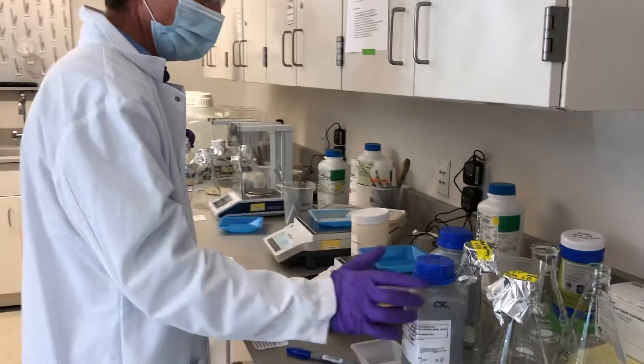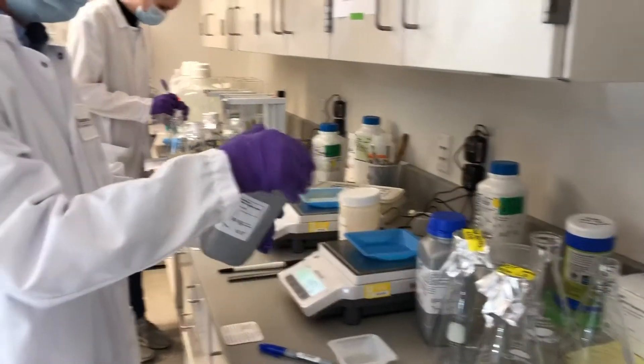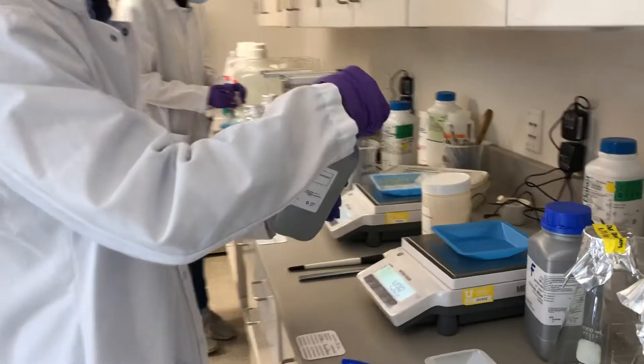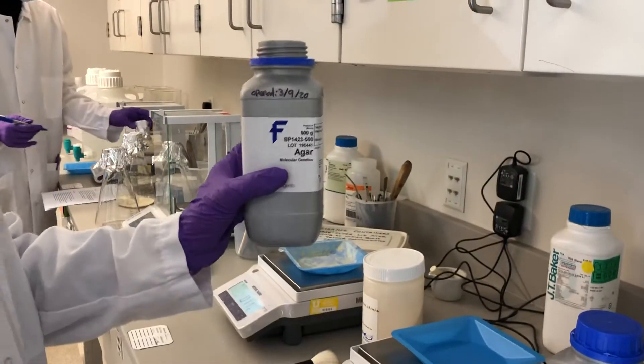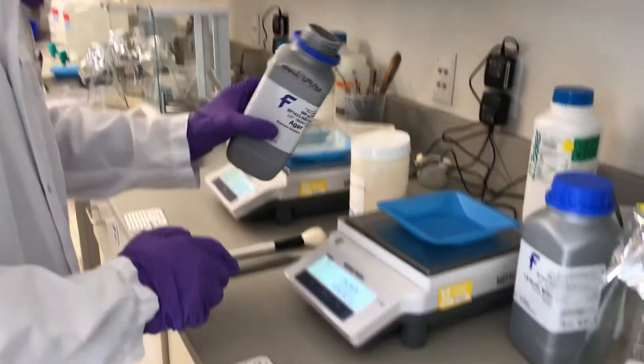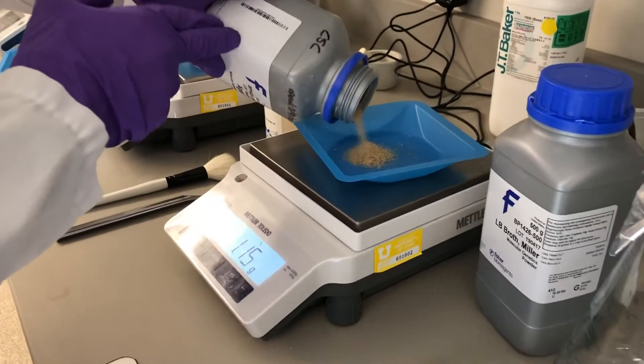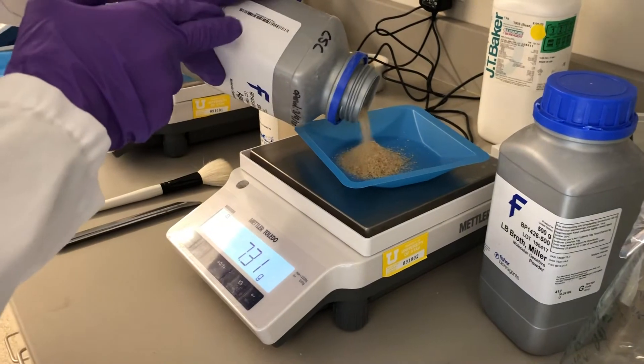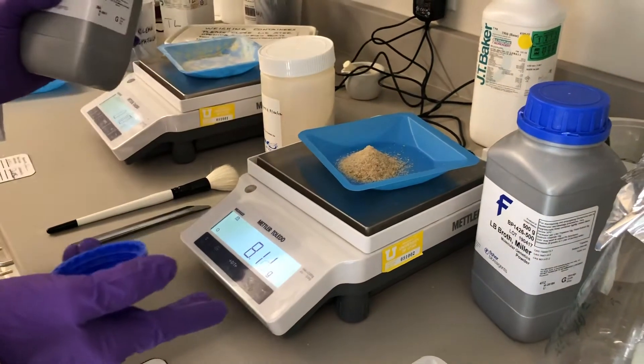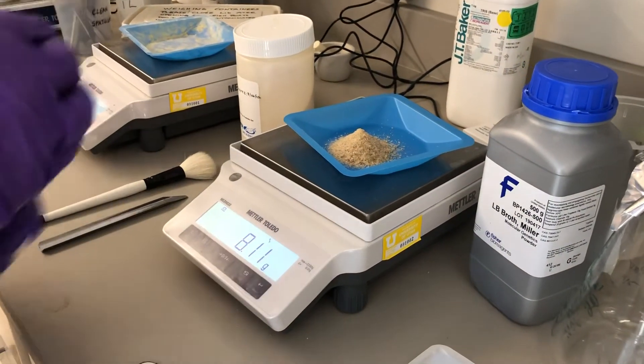The recipe is seven and a half grams of agar. So here's my dry agar. I will tare the balance and gently pour to avoid producing a lot of aerosols until I get to about seven, but eight—eight point one is okay.